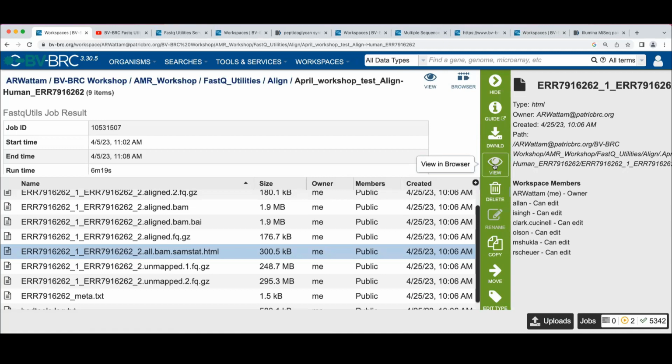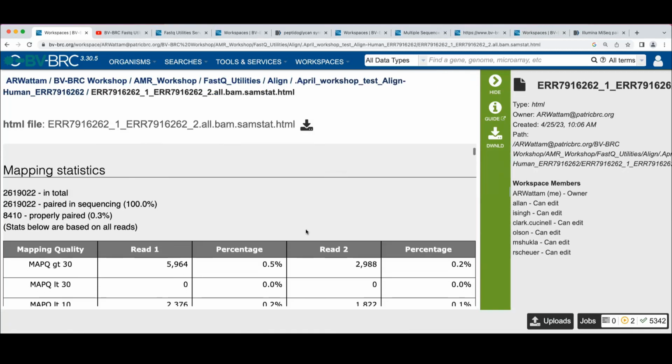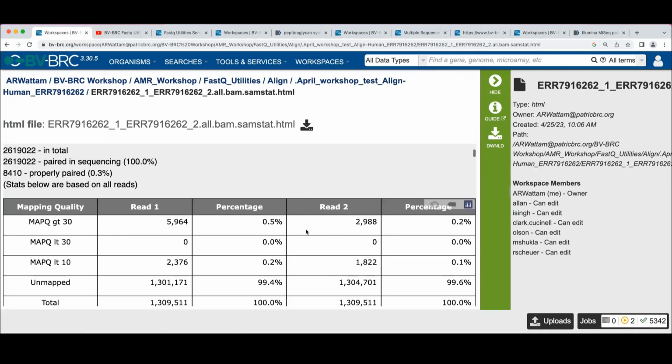So let's look at this report. Used to, it had the cutest little Pac-Man kind of thing in the world that would pop up. And then I don't know who changed it.